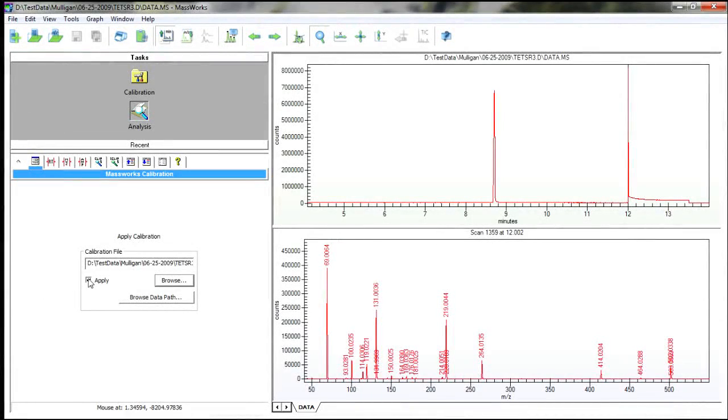The AutoCal feature would automatically detect and process the PFTBA calibration data inside any GC MSD run, and then go through all the above steps 1 through 6 automatically, so that only one single step operation is necessary to obtain the accurate mass and high spectral accuracy.